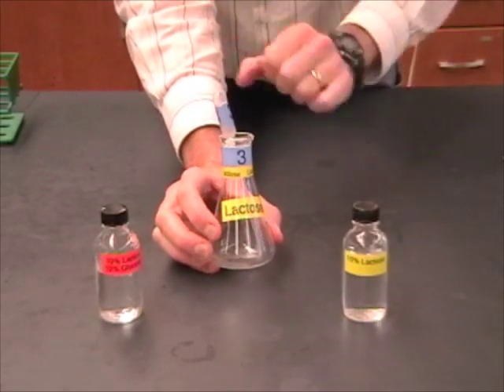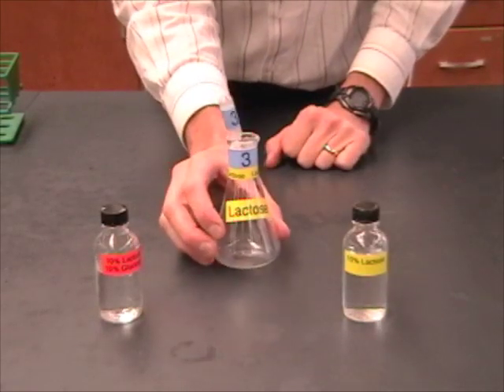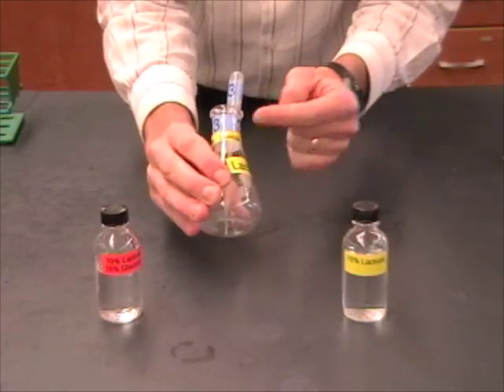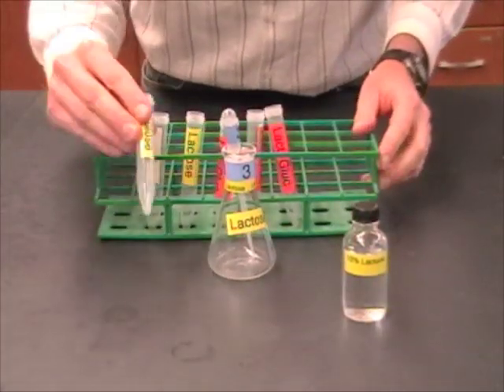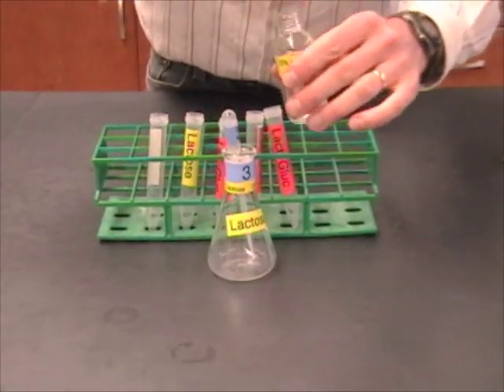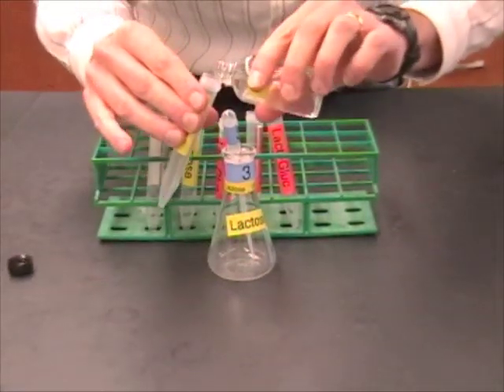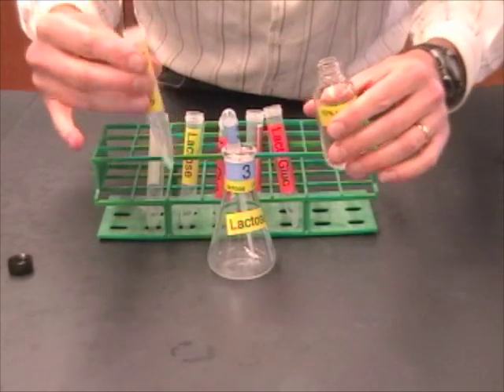But remember, every student is going to have one flask that they're responsible for. Well, I can see that I need to add lactose to my flask. So I'm going to get one of these color coded tubes, and I'm going to measure out three milliliters of lactose.